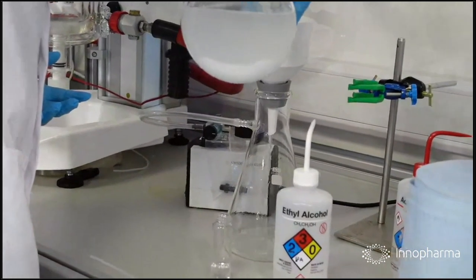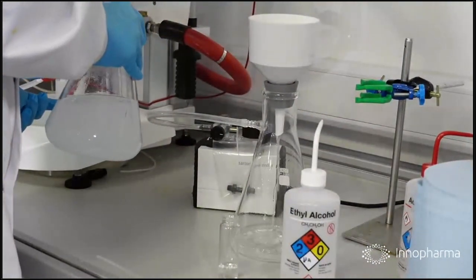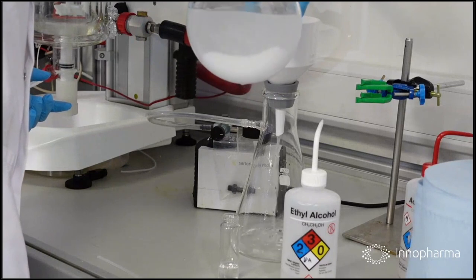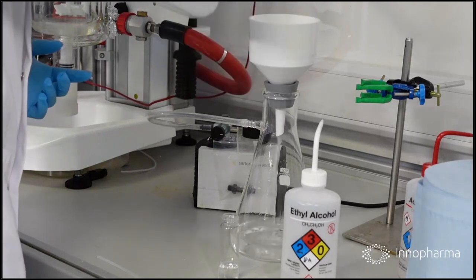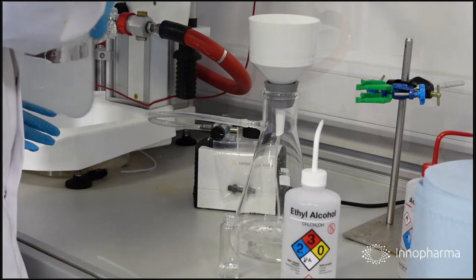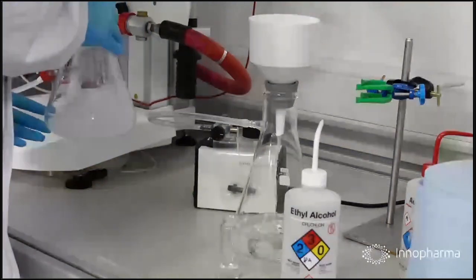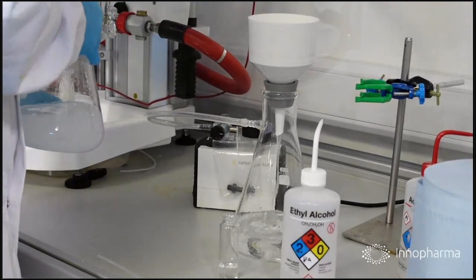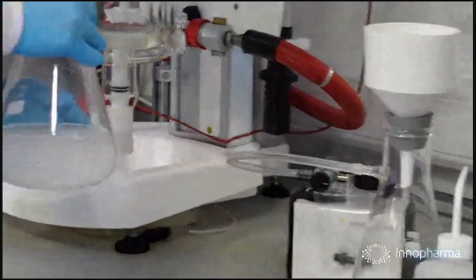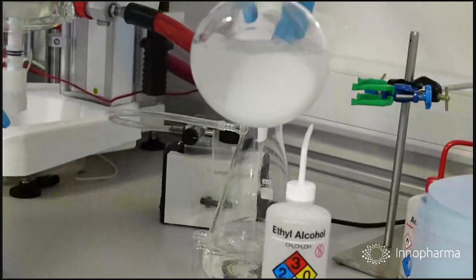Well, you can see now the process of filtration. You can see that a lot of the crystals are actually precipitating out of the suspension because they can no longer stay dissolved. They're no longer stable. They fall out. They precipitate out. And so in order to get them out of the bottle, Kieran is going to have to swirl the bottle to transfer them as they're still suspended into the filtration paper. And you can also see there in the background that the reaction vessel itself has a coating of crystals too. Well, we can show you that again when Kieran is finished.